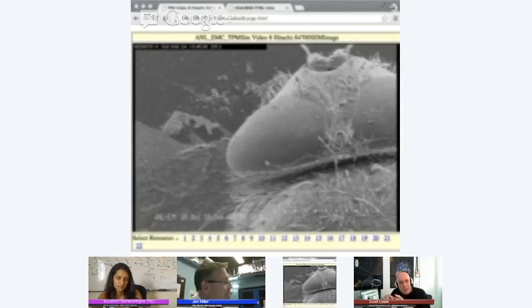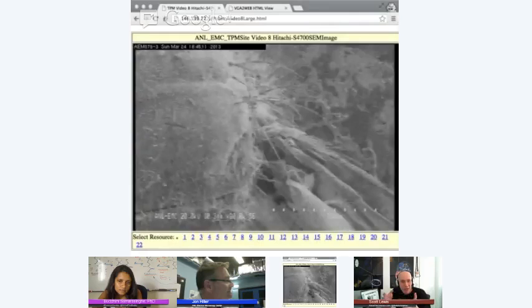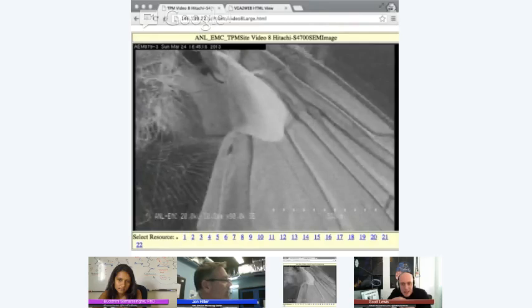Right. I'm still just blown away. I mean, we're looking at the compound eye of a fly. And, as Rajni pointed out, it's the ommatidia, I believe is what it's called. And just the shape and how you can see the patterns, the way that's assembled on something so small as the compound eye of an insect. It just blows me away. And so this is a wing. Wow.